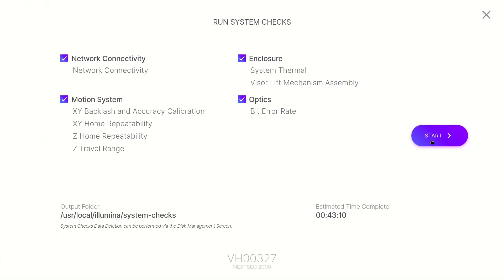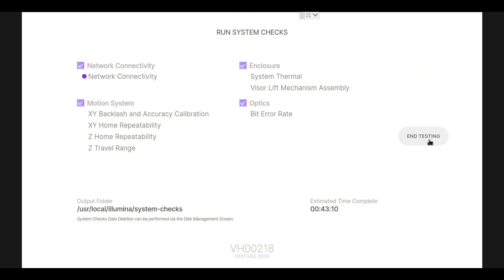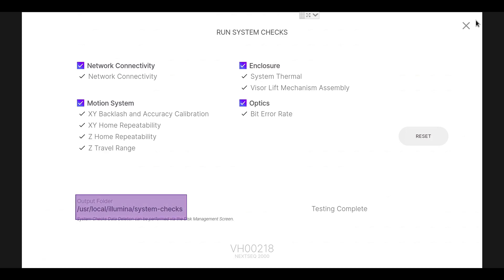When you've selected the desired tests, select Start. Once the check is complete, observe the pass-fail results. If the results are requested by Illumina personnel, the test results can be found in the system check folder.